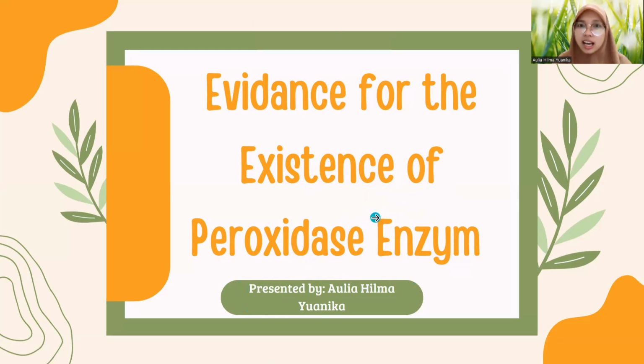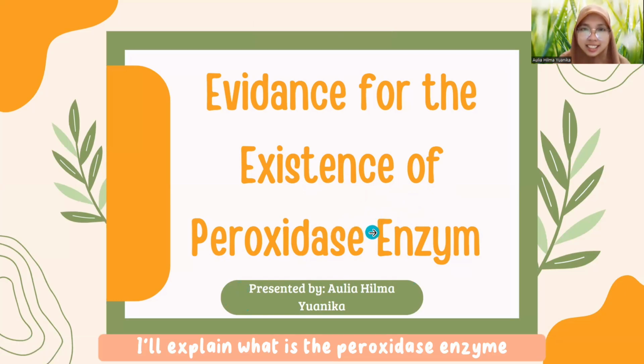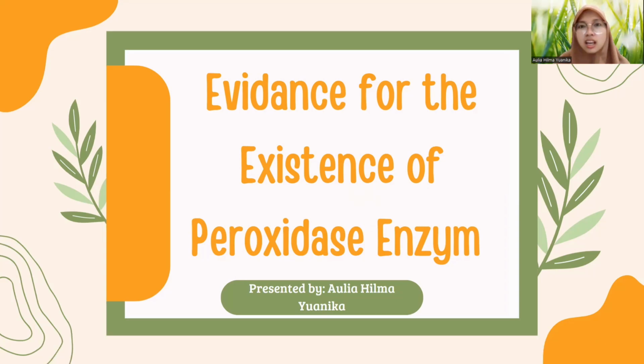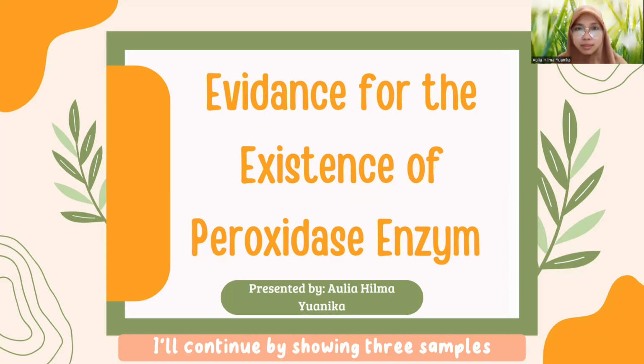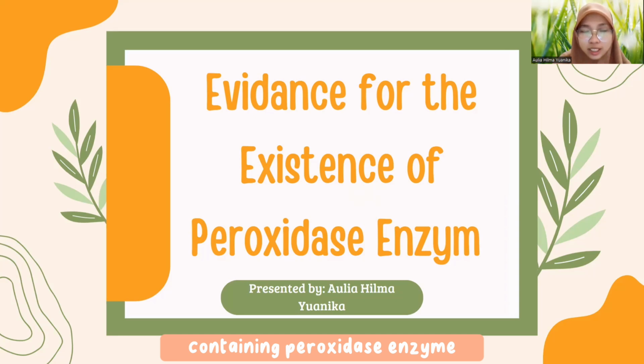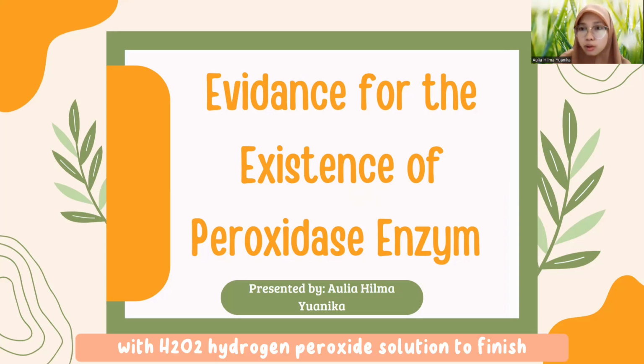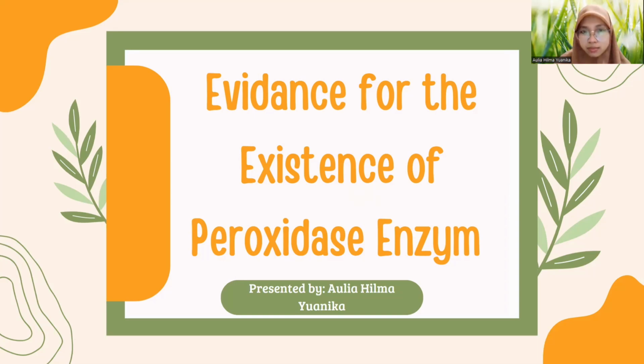First of all, I'll explain what the peroxidase enzyme is and how to prove the existence of peroxidase enzyme. I'll continue by showing three samples containing peroxidase enzyme and why there is a difference in result when reacted with H2O2 hydrogen peroxide solution. To finish, I'll be concluding the result of the experiment.